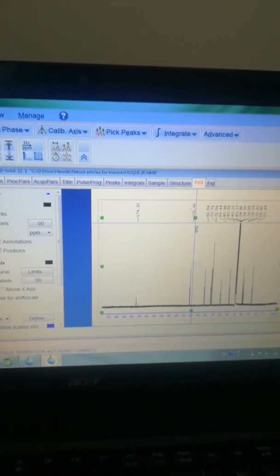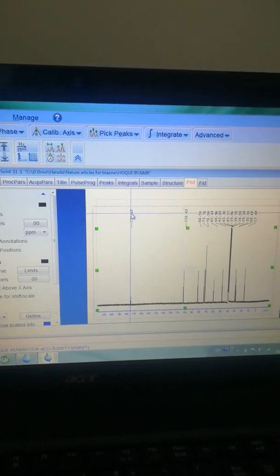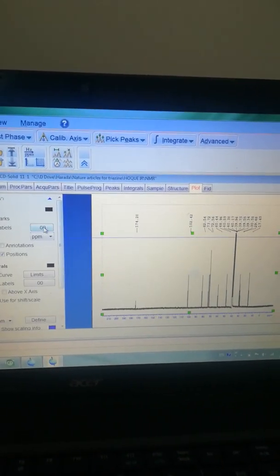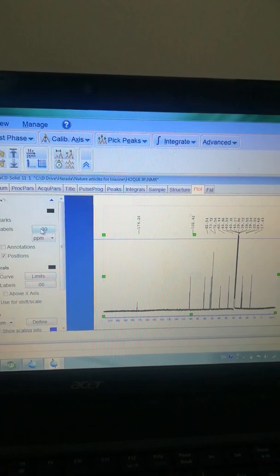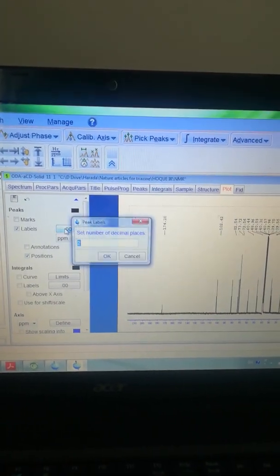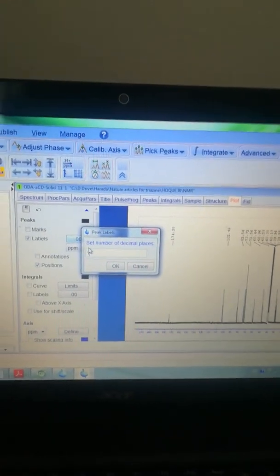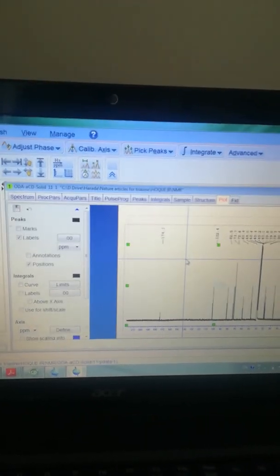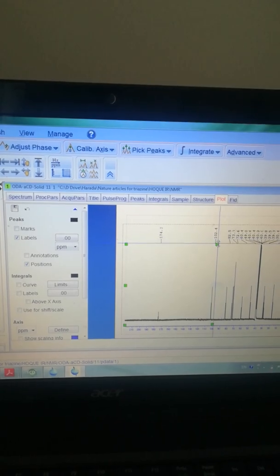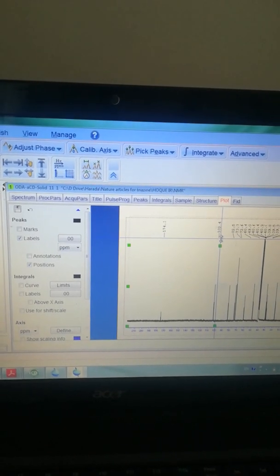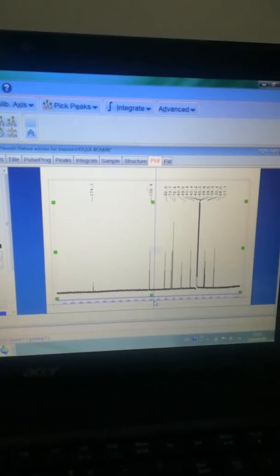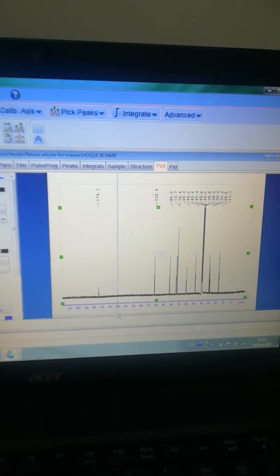You can see the labels show two digits after the decimal point. I only need one digit, so click here and type the command for one decimal place and press Enter. Now only one digit after the decimal point — it looks quite good. However, the scale font is not uniform with the peak picking font.